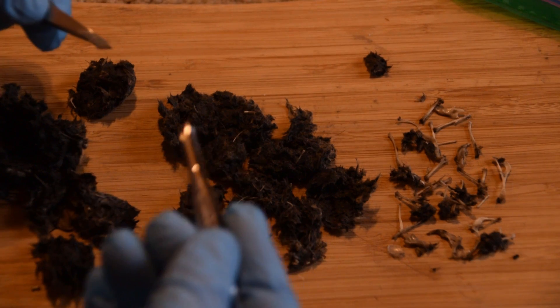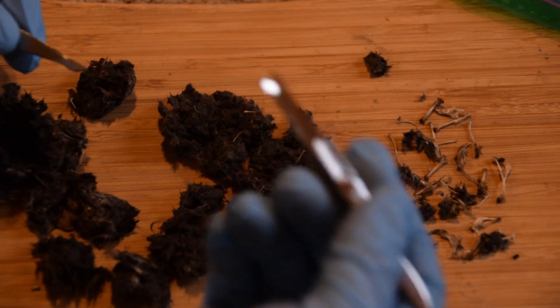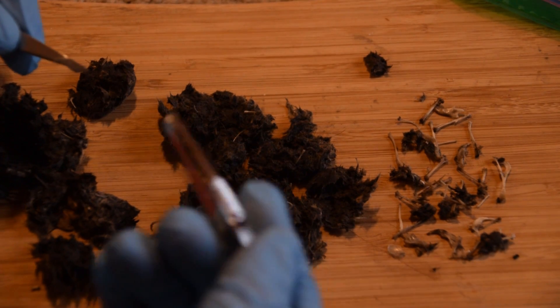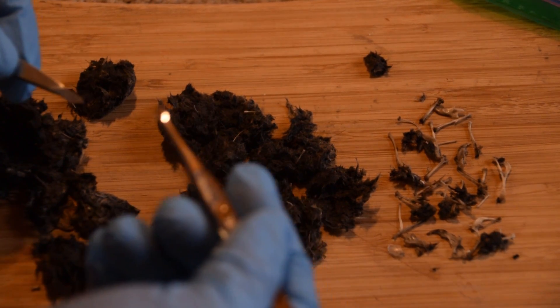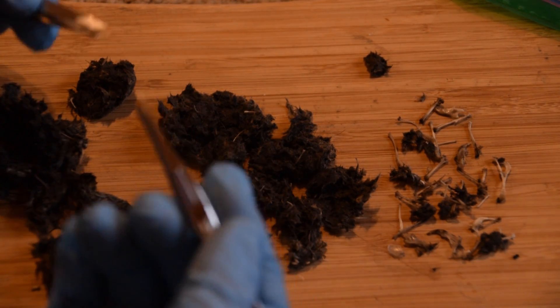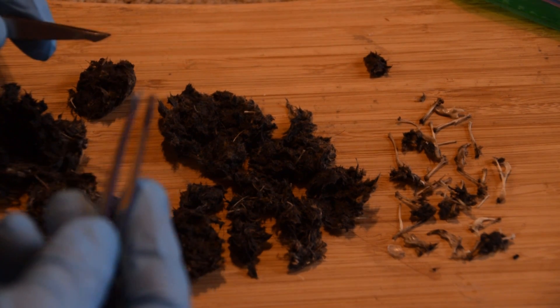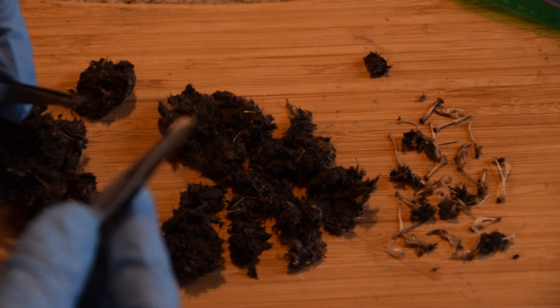Now, because this probably isn't the most interesting thing to watch for some people, I am going to jump the camera forward several minutes so you guys can see what I pulled out of this. I'm only going to be pulling out whatever I felt comfortable gathering, so we'll jump the camera forward a few minutes and then we'll see what bones we have.